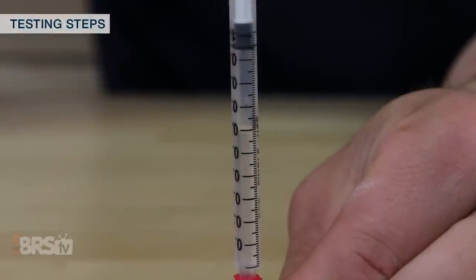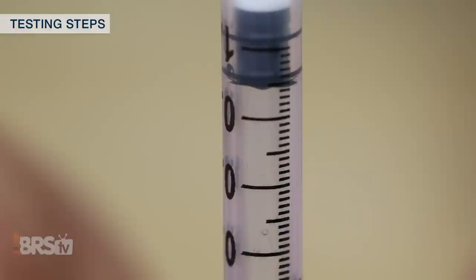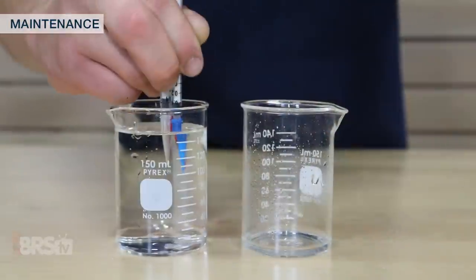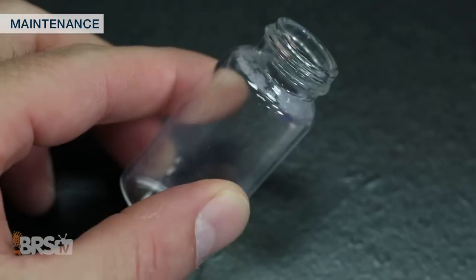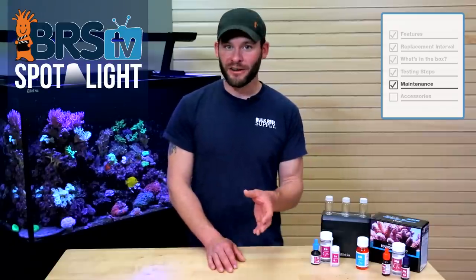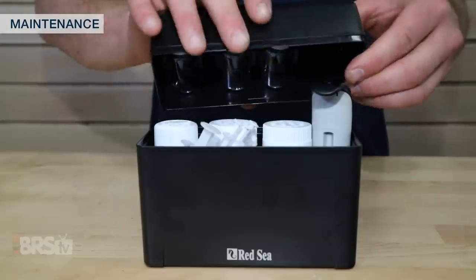For example, every hundredth of a milliliter — every graduation line — is equal to five parts per million of calcium. Maintenance is very simple with the Red Sea test kits, especially if you stick to rinsing and storing the vials and syringes with RODI water. If you notice some buildup within the vials, you can easily remove it with a little vinegar and water solution. It's also best practice to utilize the hard shell case to store the reagents, which keeps them from any possible light exposure damage.